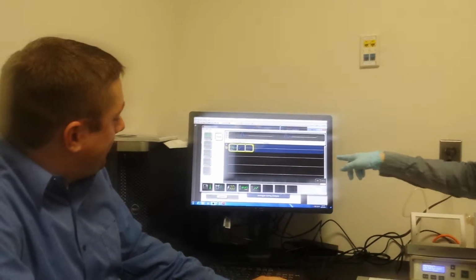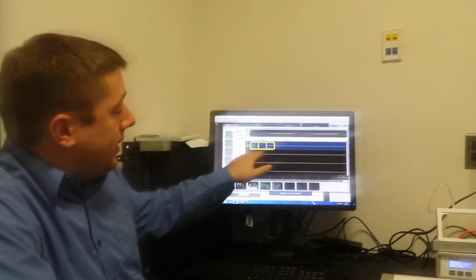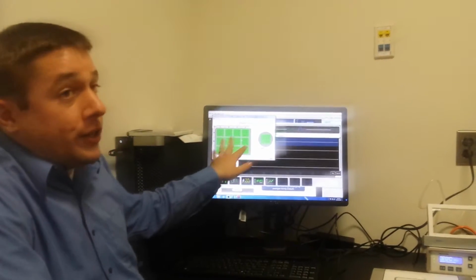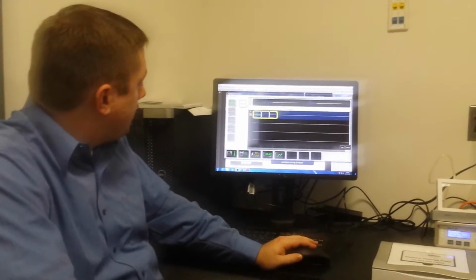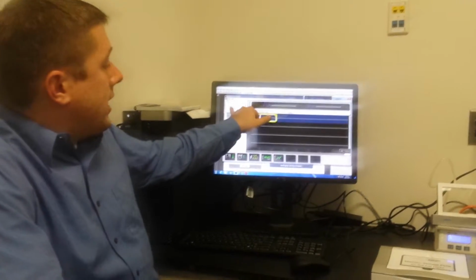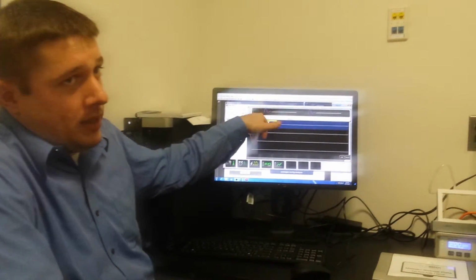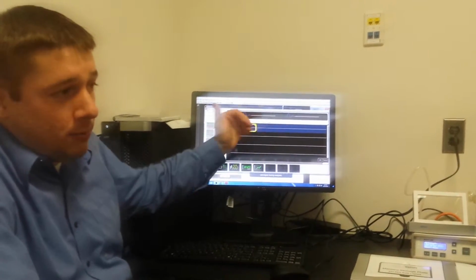How did you get into this screen? This is the lightning bolt. Oh, that. Yep. All right, once you have it all set up here, go in and figure out which electrodes you'd like to use. Close this. You can save the stimulation for future use, and I recommend saving it for its notes. The next version should save the waveform and all that, but right now it doesn't.